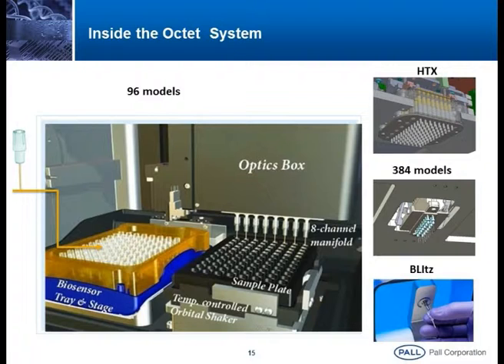So as I said, we don't have microfluidic devices. To assist binding, we require a shaker. So the shaker enhances the binding. We can work the shaker from 100 RPM to 1500 RPM, depending upon the application. Suppose I am working with a very high concentration, I can use a low RPM, 400 or 500. If you are working with a very low concentration, then I have to increase the RPM speed. So the shaker will enhance the binding.